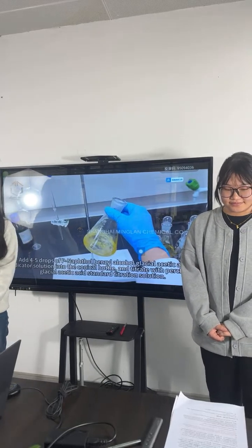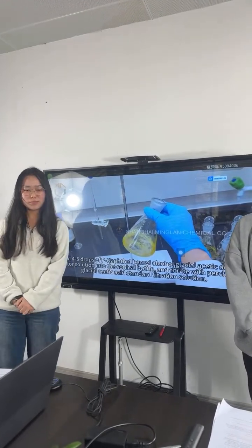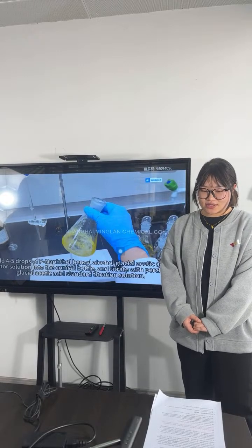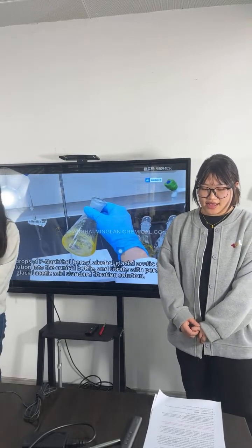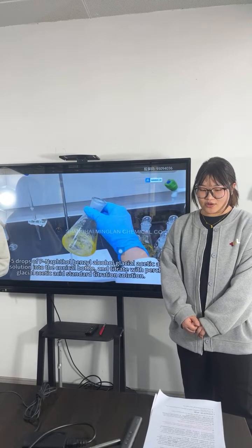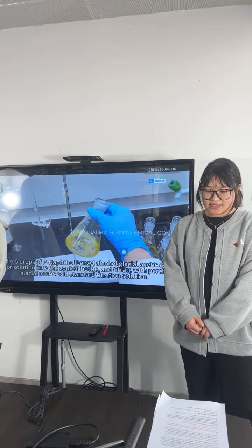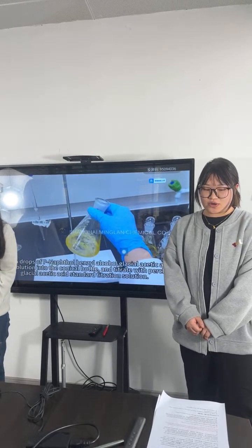Winnie, do you know how to prepare the perchloric acid glacial acetic acid solvent mentioned in this experiment? The titration solvent should be prepared in advance. Mix 500 milliliters glacial acetic acid and 30 milliliters acetic anhydride together and add 8.5 milliliters of perchloric acid. After mixing evenly, continue to add glacial acetic acid to dilute to 1 liter. Let it stand for 24 hours.